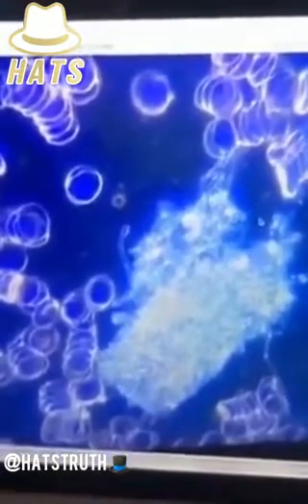Definitely something alive. Was it moving live? This thing here wasn't moving, this crystallized structure. They weren't moving like this, but they were kind of growing, sticking out. Wow, this is insane, guys.